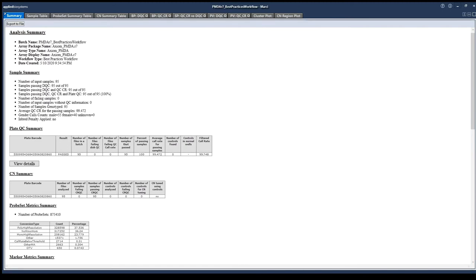First, in the summary tab, we see that the array plate shows passed for the result in the plate QC summary. This is important, since if a plate showed a failing result here, we would likely not recommend that this plate be used in the later copy number discovery workflow. For a plate to pass, it must have an average call rate across all passing samples of greater than 98.5. Now let's look at the sample table to review some of the other metrics.